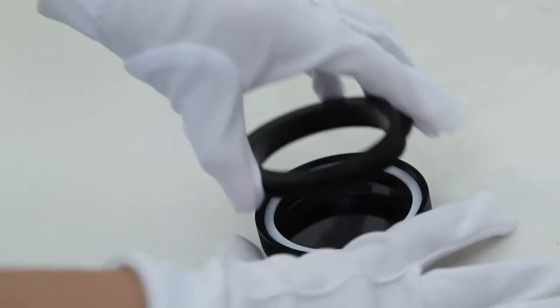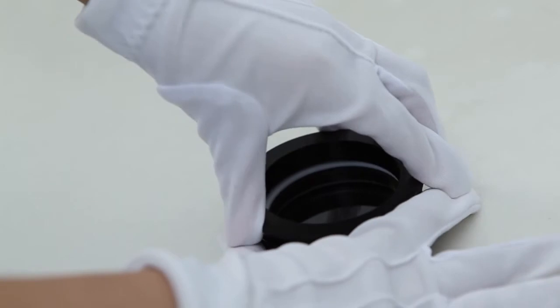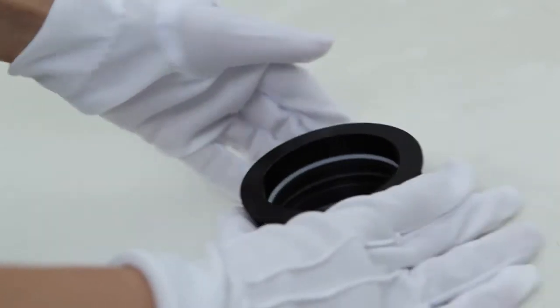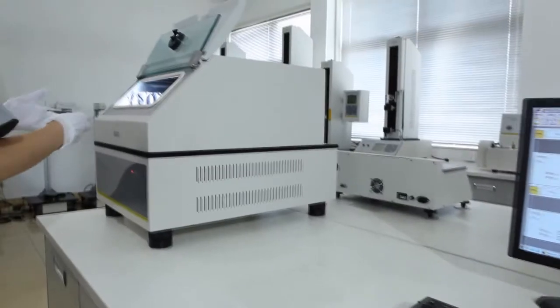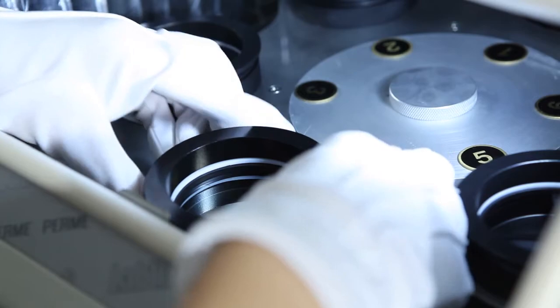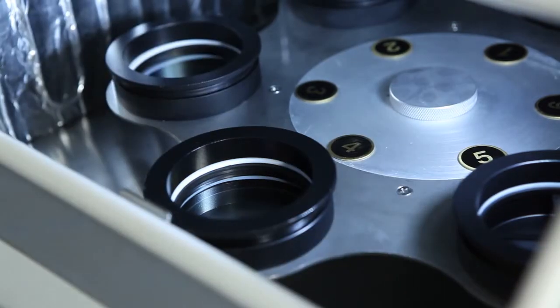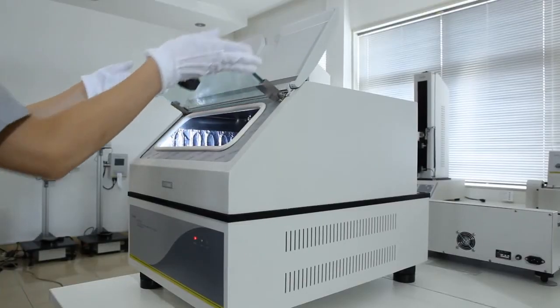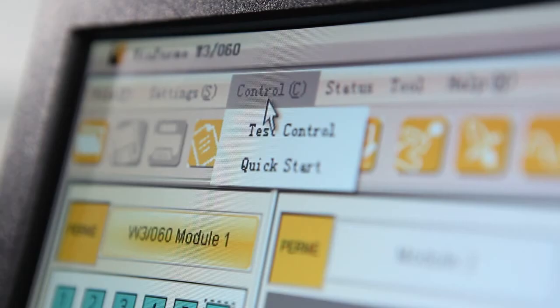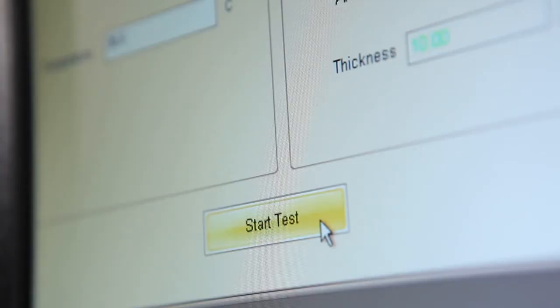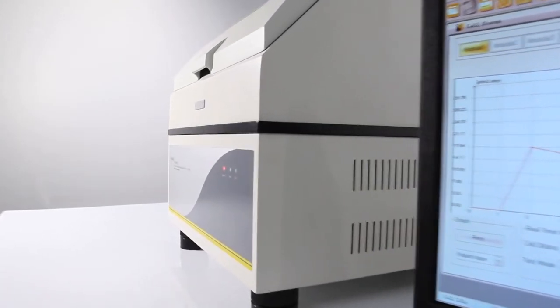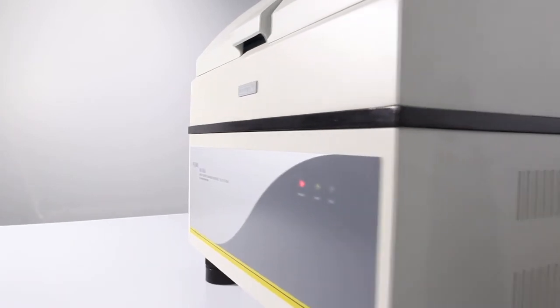Operating the instrument is simple and convenient. Users only need to place the prepared testing cups onto the rotary pallet according to sequence, complete the parameter setting and click on the start test button. The W3060 will then accomplish the test automatically.